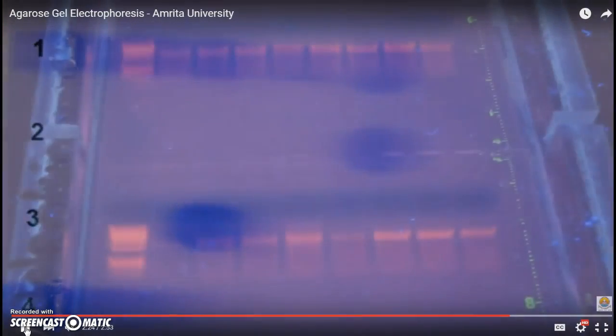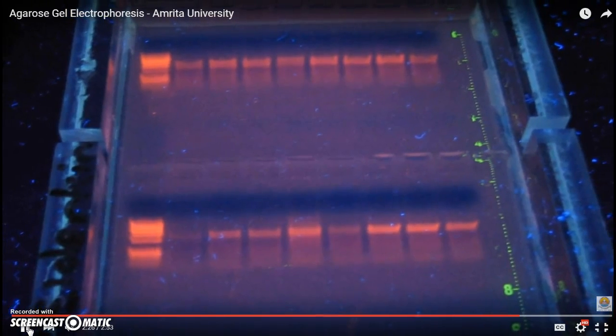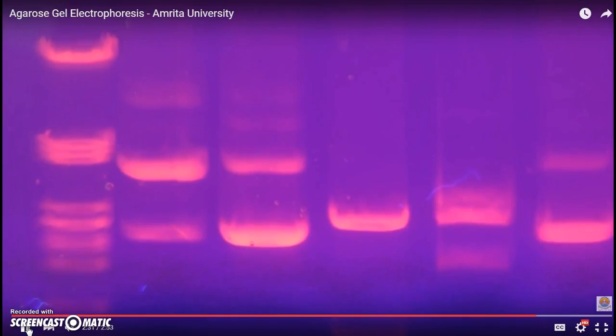Okay, so you can see the DNA travels through, and that's what it looks like when we actually light it up. So you can see that, we get these positive bands where the DNA traveled. Okay, so it kind of looks like that. And usually on the far left, we run a sample of DNA where we already know how big these pieces are. And so we can compare our samples to the known samples. So this is always sort of the positive control.